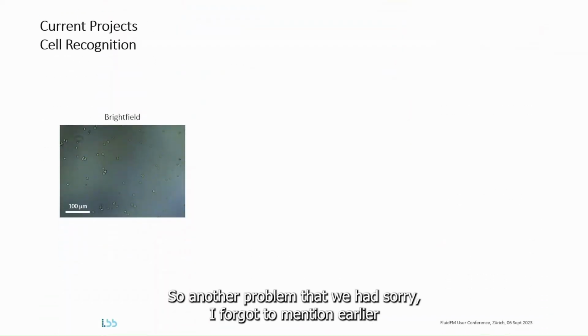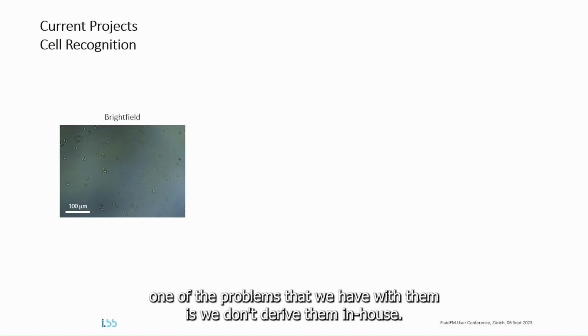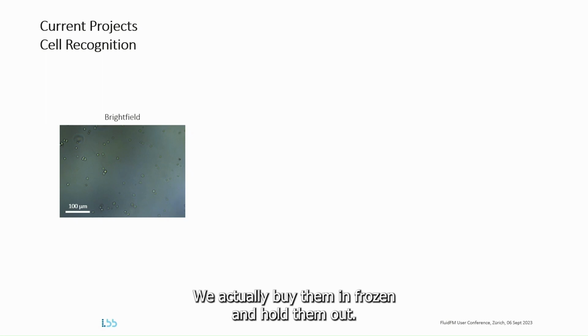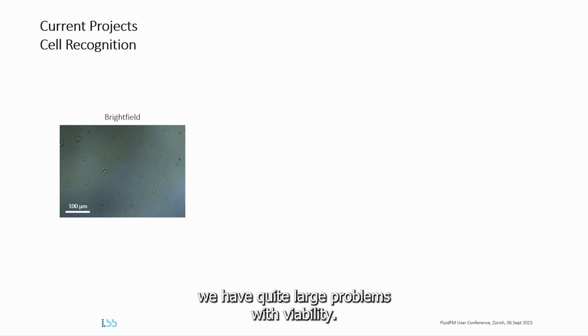Another problem that we had, sorry, I forgot to mention earlier that the cells that we are using are primary rat cells, but we're also now transitioning to iPS-derived cells. So iPS-derived cells are great in that they more closely replicate human cells. However, one of the problems that we have with them is we don't derive them in-house. We actually buy them in frozen and thaw them out.